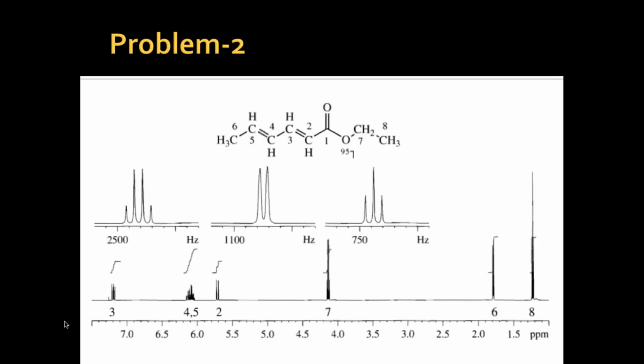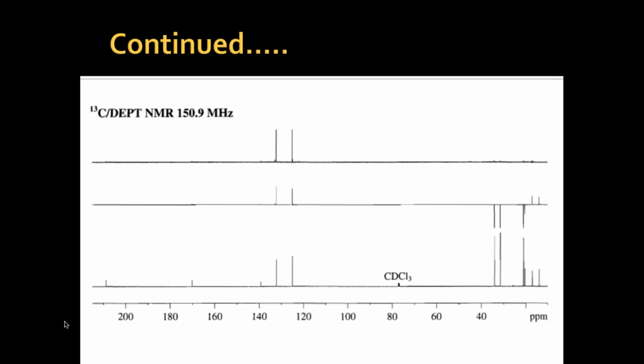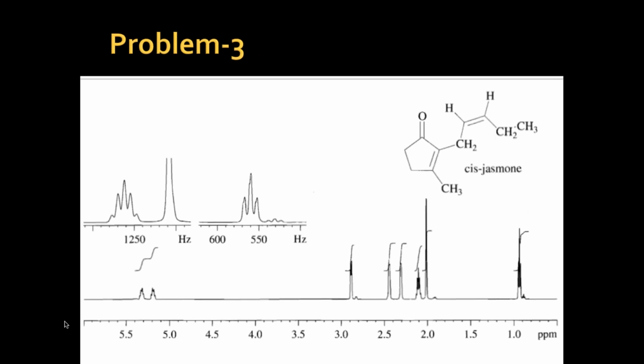I'm not saying that this is a symmetrical molecule, but once the proton spectrum gets complicated, we need the help of DEPT, NOESY, COSY, HSQC, and HMBC to study all those parameters and align all the protons and the carbons along with the NMR. So proton NMR alone will not help in those cases.